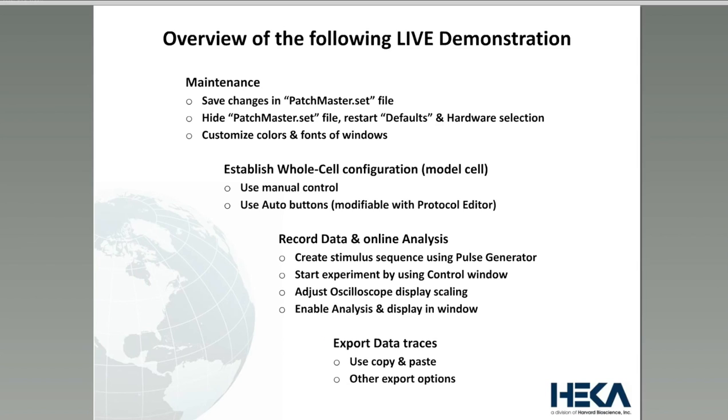Okay, this concludes the PowerPoint presentation, and I would now change to the live presentation. For that, I will have to share my screen, which I do now.